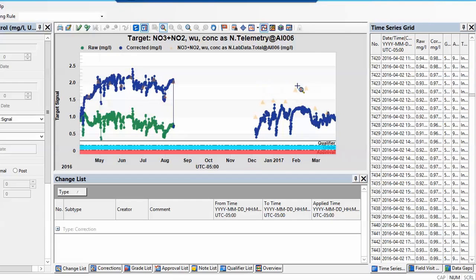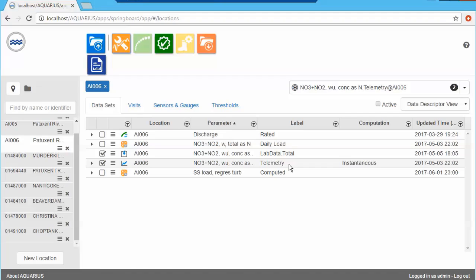And we can also see for my newer data, this data correction has not been made yet, but we can already see from the lab sampling data, it's quite obvious that I probably need to do some drift corrections right there to make sure my sensor readings are correct. So let's assume I've used my lab data to make sure that my sensor data is QA/QC'd in the best way.